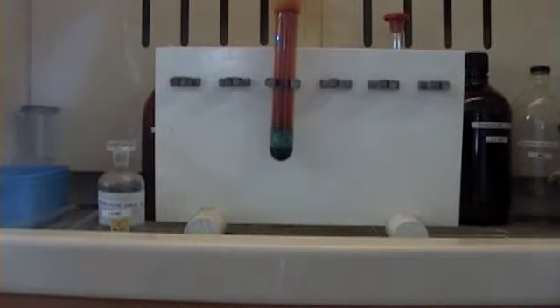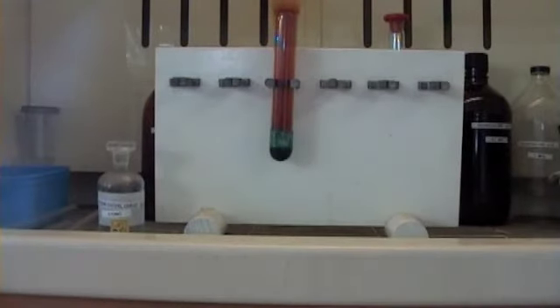Already we've got green colour forming, and if I just back off a little, we can see significant amounts of brown gas, which is nitrogen dioxide being formed there. The green colour in the bottom is indicative of which ion? Copper. Which copper ion? Cu2+, yep.